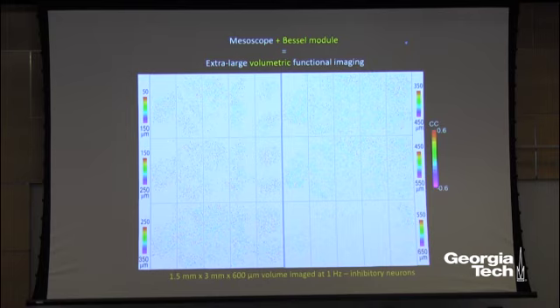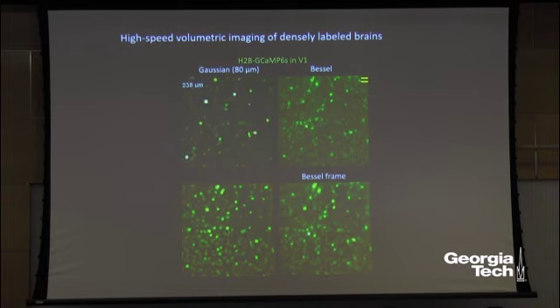From the more posterior to a more anterior region, you can see there's a little bit more positively correlated neurons with the pupil diameter. And imagine that if you are interested in a particular behavior task and you use this kind of method to measure the neural activity, you get a huge amount of information of how the brain is behaving during your task. So how about if I want to not just limit myself to inhibitory neurons?